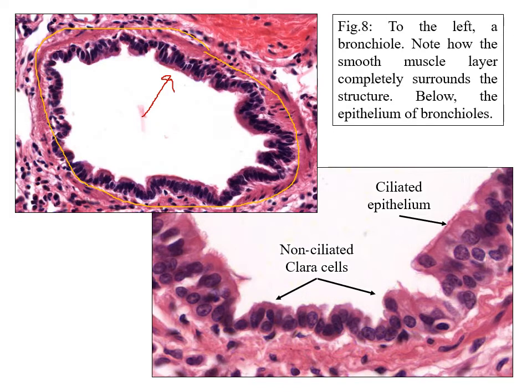Also, the epithelium lining here is no longer respiratory. It is simple ciliated epithelium, simple columnar or simple cuboidal ciliated. Also, we can see that goblet cells have disappeared. They start to decrease gradually until they disappear by the time we reach the terminal bronchiole. Most of the function of goblet cells and other functions are taken up by Clara cells.